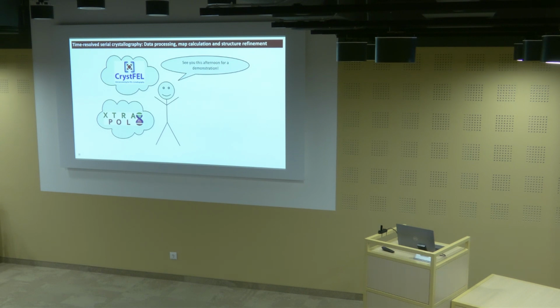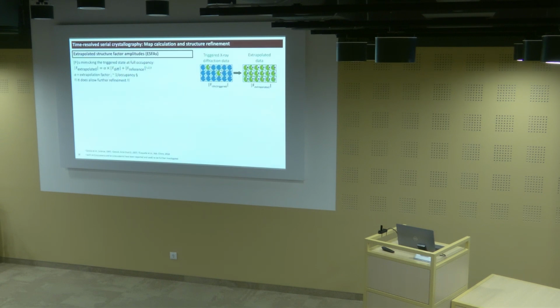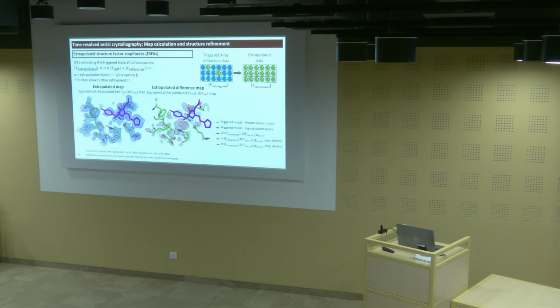On slide 20, you had a note at the bottom about the extrapolation factor, and you had one divided by occupancy and two divided by occupancy. Could you elaborate more on that?